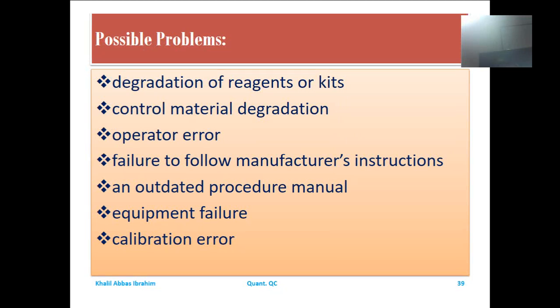Possible problems frequently encountered in laboratory services are the degradation of reagents and kits used in the laboratory, degradation and spoilage of control material, and operator errors, which are very common, actually, and which may indicate poor training, poor qualification, or poor concentration of the people working in the laboratory, and failure to follow manufacturer's instructions without reviewing the manuals.